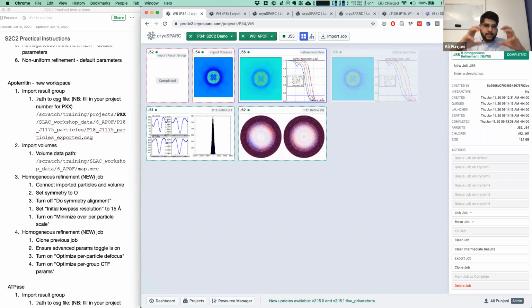If you try to do defocus refinement or any kind of CTF refinement, it actually makes the results worse because the protein is flexible and the micelle is disordered, and it's a small protein in difficult conditions, which means that the reference structure when we're doing CTF refinement never matches the particles very well. Either the experimental particle is in a different bending position, or the micelle is in a different configuration, or something else is off that makes those two not match up, and it throws off this defocus refinement and CTF refinement completely to the point where the results get worse.